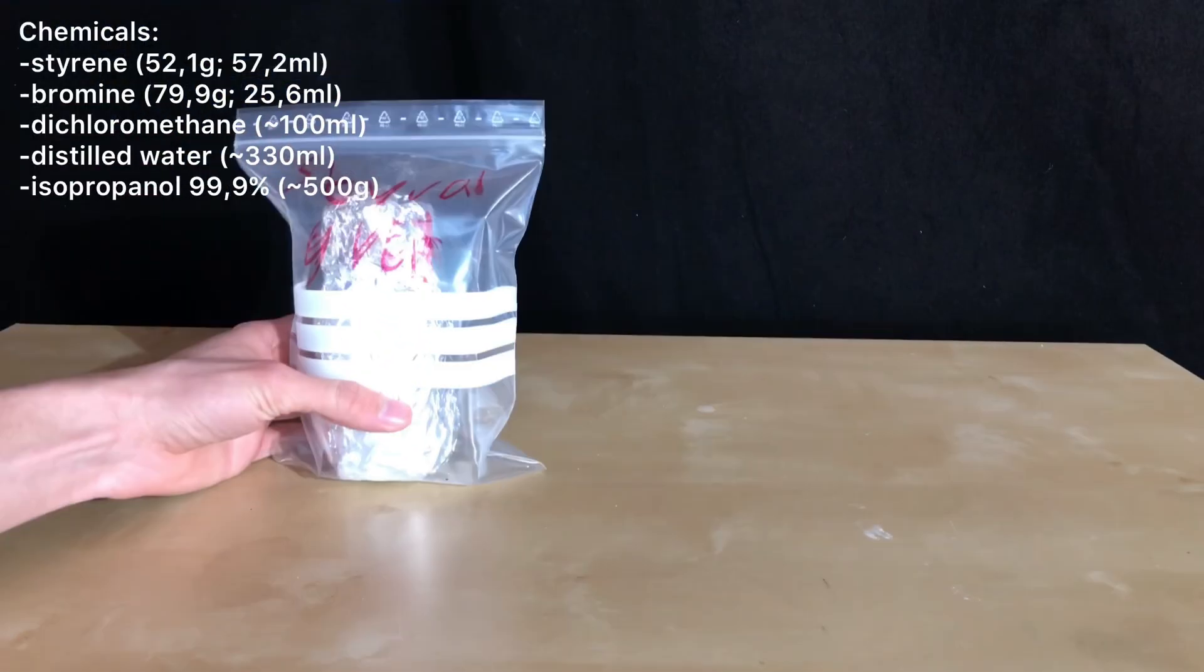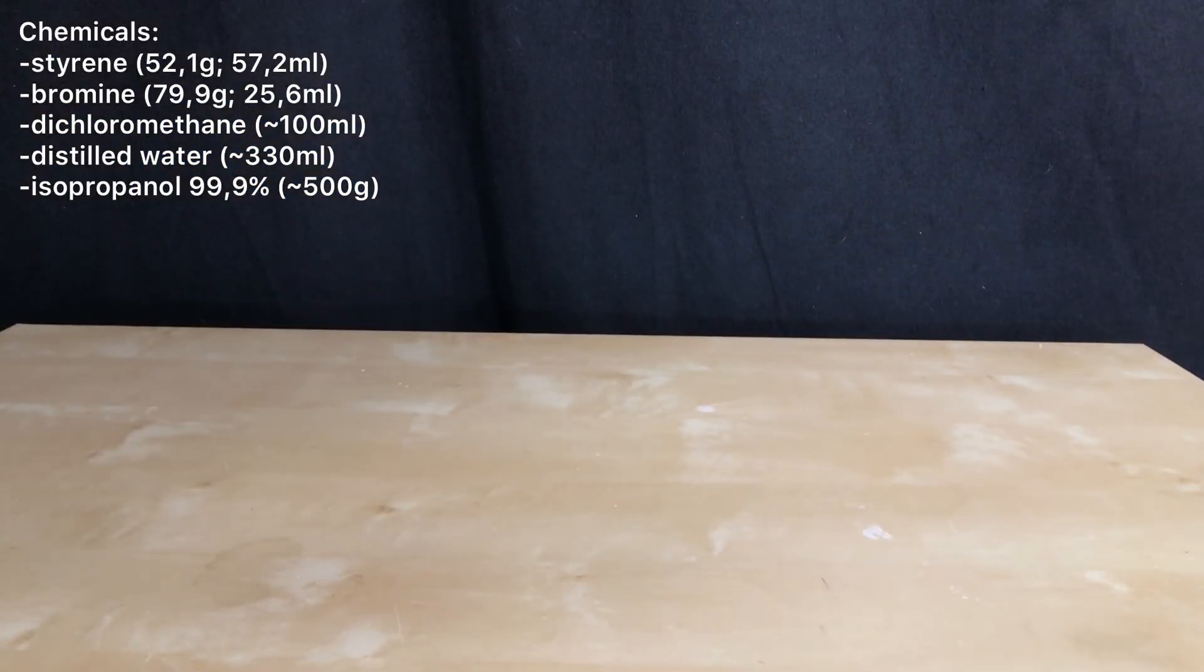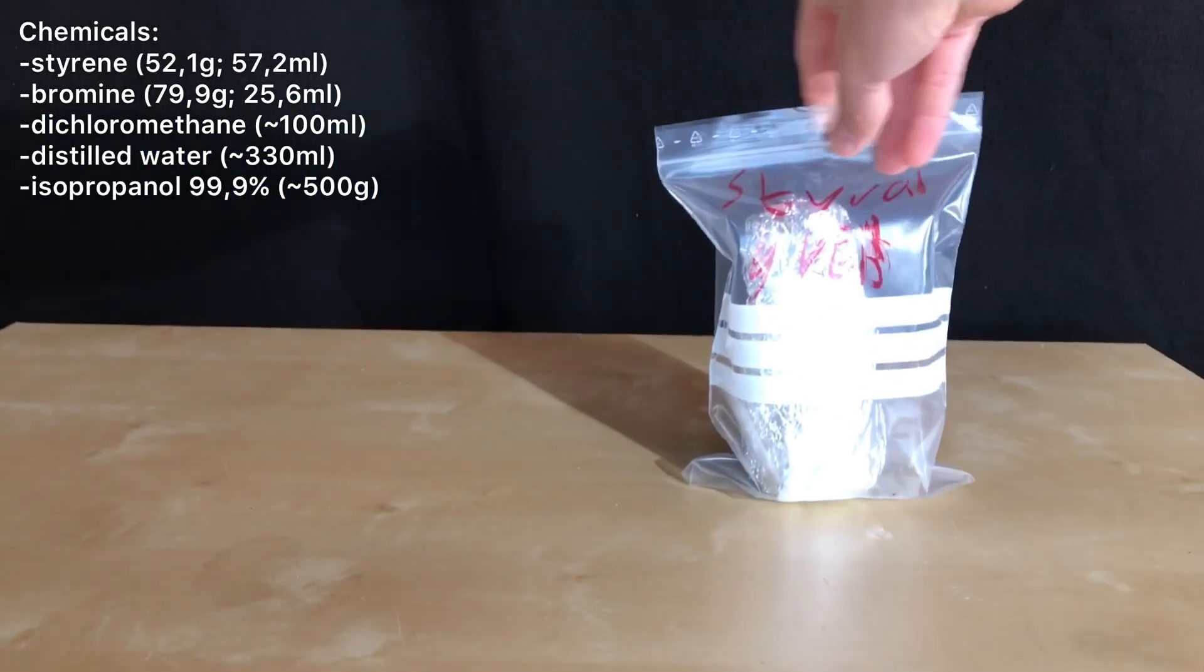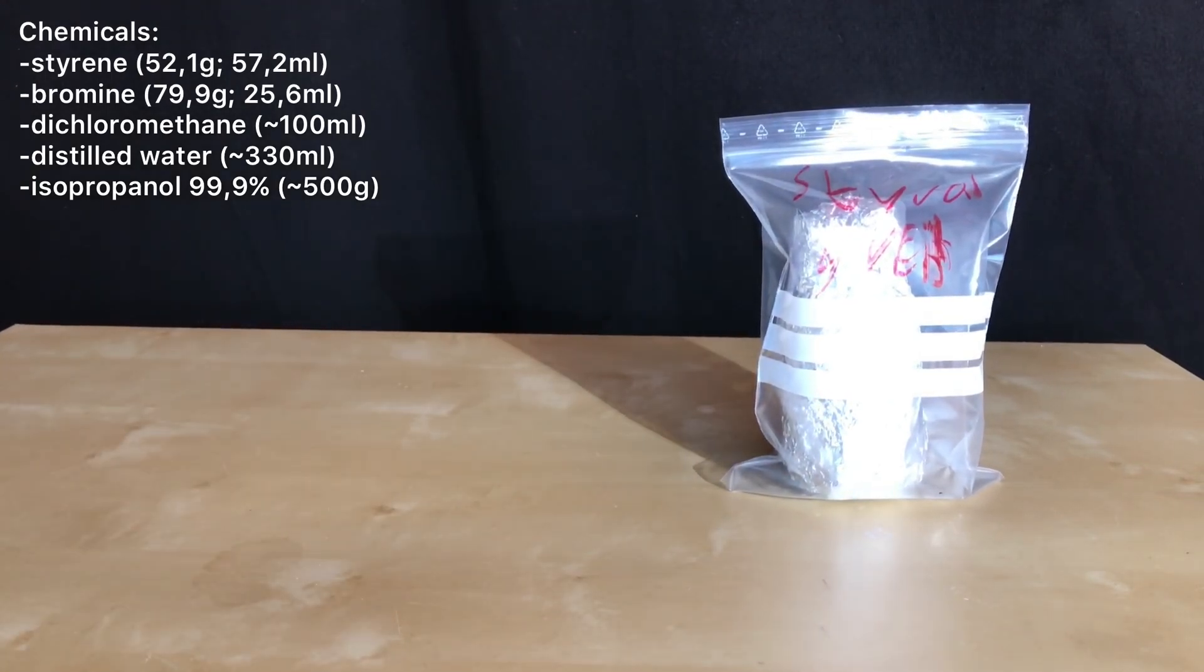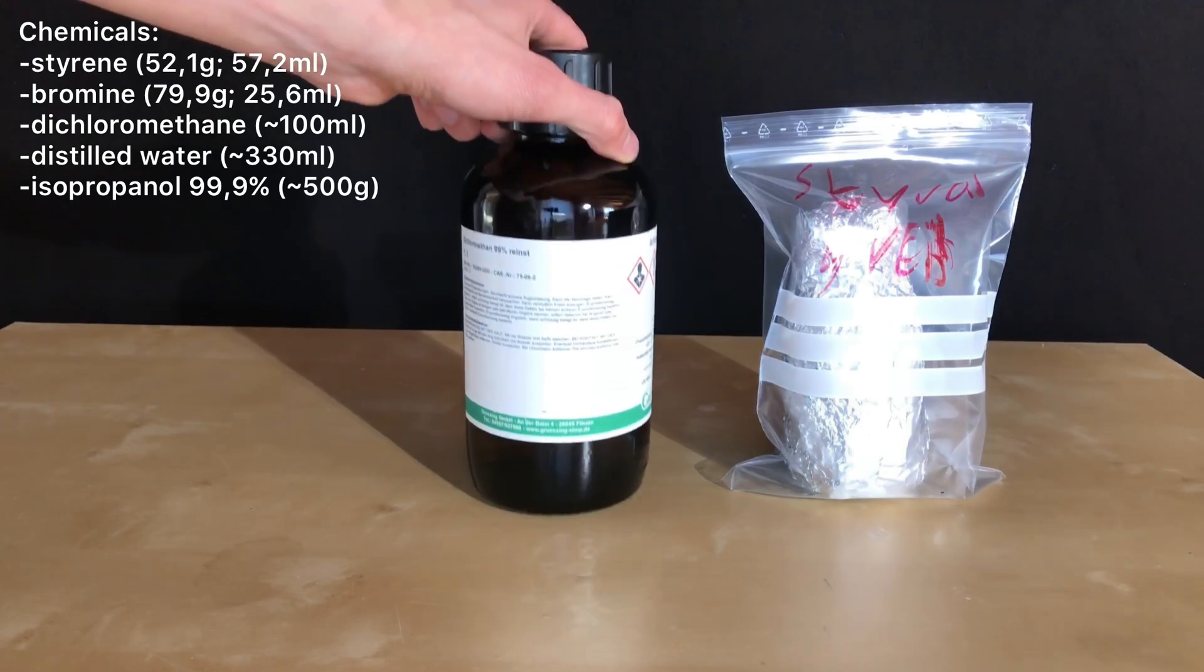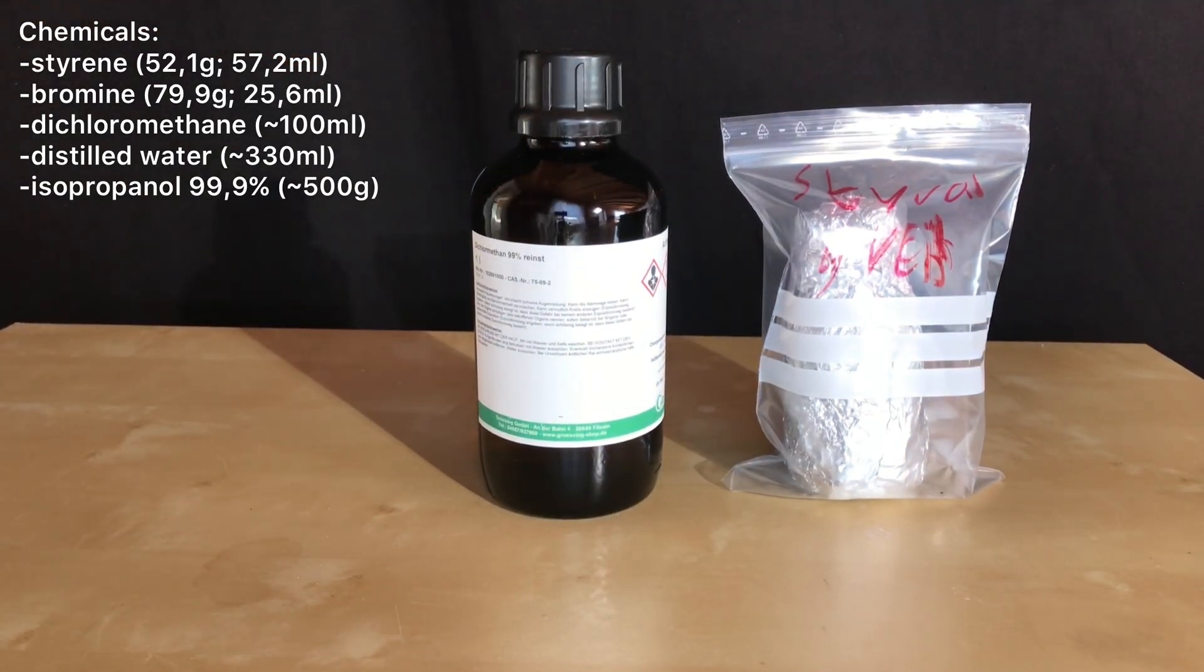Welcome back everyone, today we are going to make some 1,2-dibromo-1-phenyl-ethane by brominating styrene. The preparation requires 57.2 ml of styrene, 25.6 ml of bromine and about 100 ml of dichloromethane.